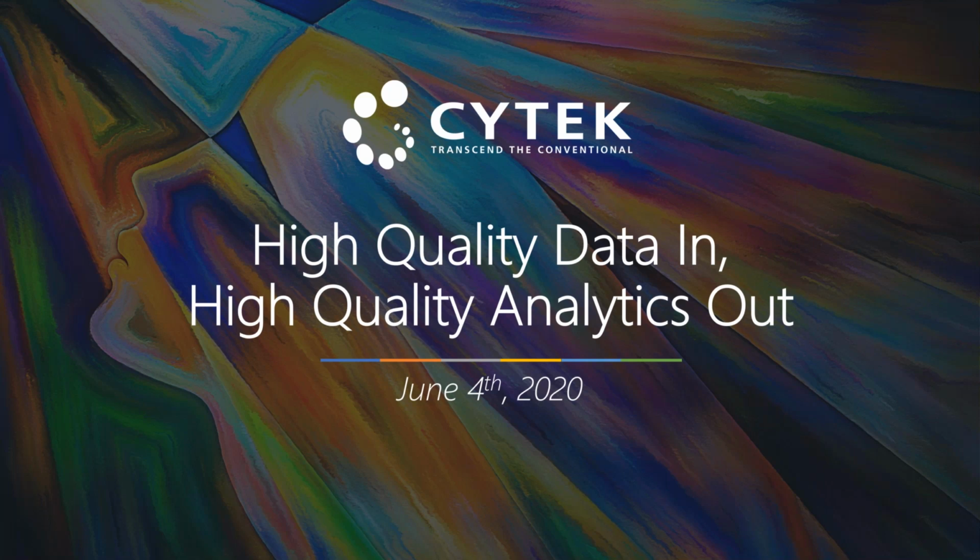But before you even think about the different analytical solutions, you need to make sure you have rock solid data that is trustable and reproducible, and do some work ahead to catch if there were any issues with sample preparation, staining, instrument performance, or any batch effects that need to be taken into account. Today, I will review the steps that you need to do before jumping into any of the options for high-dimensional analysis that we will see today.